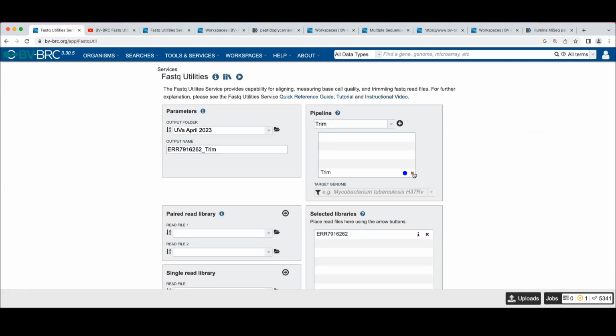And now we're going to do something a little bit different. Remember when we ran this on taxonomic classification, there was Haemophilus influenzae. What was one of the other two predominant organisms that we could see in there? So it was the human genome.